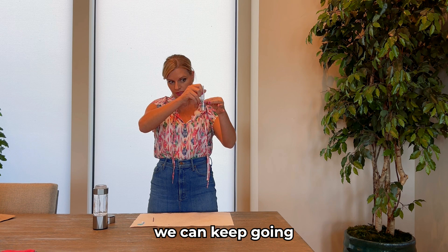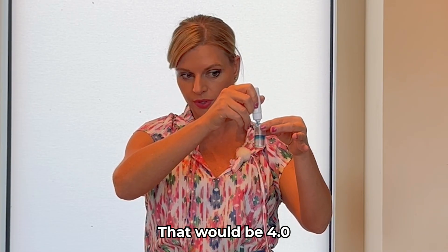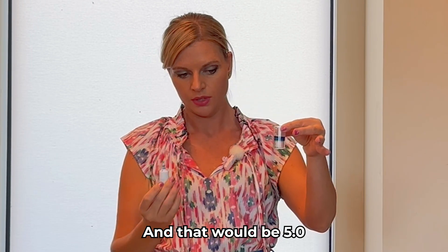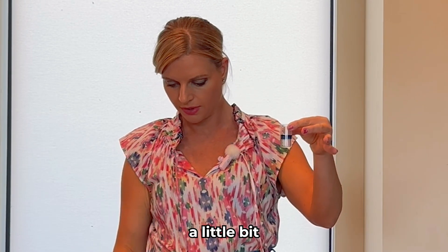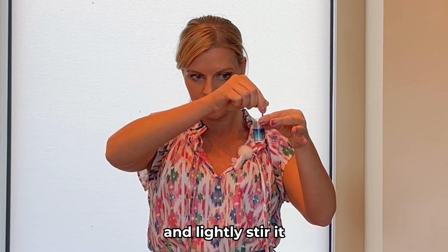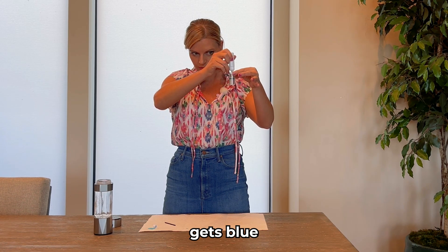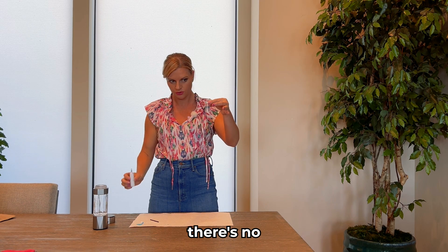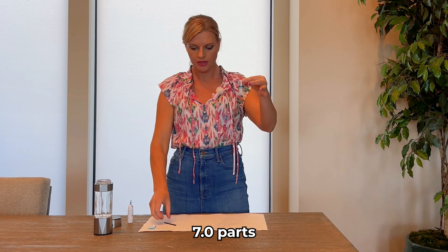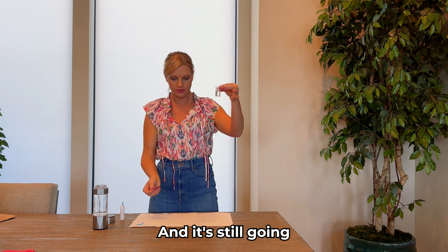So we can keep going — adding 1 through 7 more drops, that would be 5.0 parts per million. It's pulling up a little bit, so take your stir stick and lightly stir it. Now we have 5.0. When the whole thing turns blue, you know for sure there's no more hydrogen. And it's now at 7.0 parts per million — so there's at least 7.0 parts per million here, which is great, and it's still going.